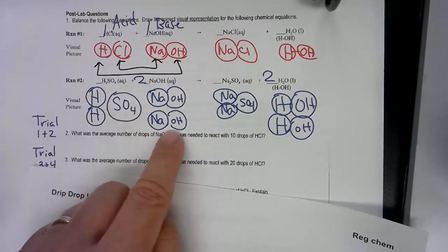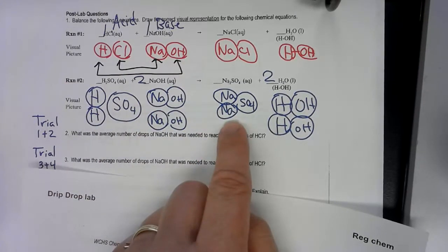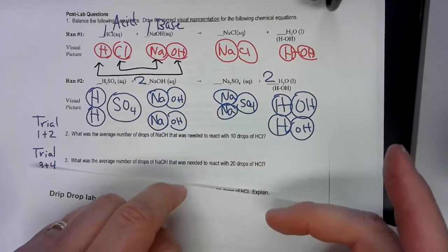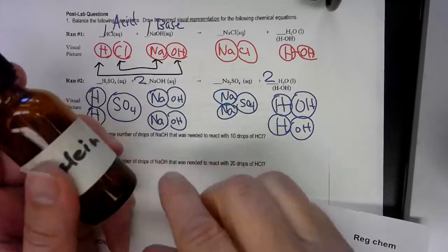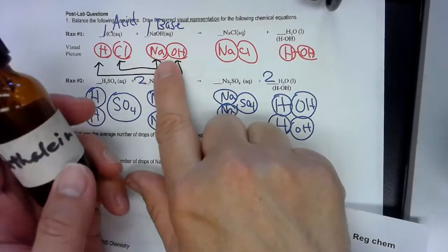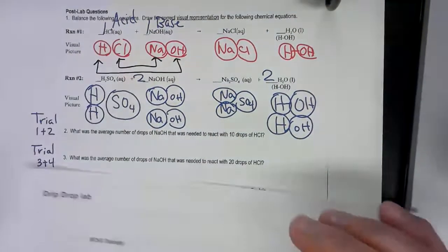So go ahead and draw the visual particle drawing so you know there's 1 of these for every 2 of these to make 1 sodium sulfate and 2 waters. It's really the H's and the OH's that come together to form water, and you really can't see that. So we use this indicator to show that when you have equal amounts, it's still clear. But when you go 1 drop over, when you don't need any more, it makes this indicator turn pink. It's called phenolphthalein. Okay. So let's go ahead and do the results.